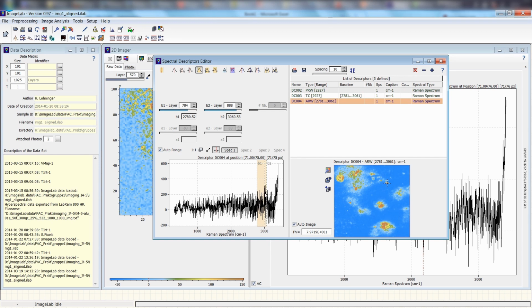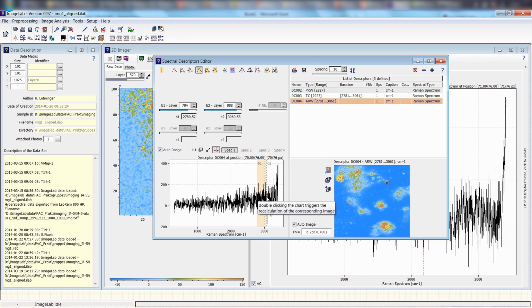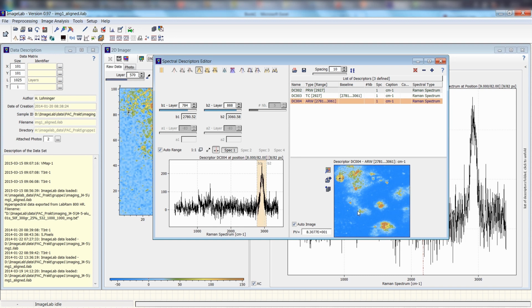And as you see here in this particular tiny spot, you get here noisy data, but the average of these noisy data points is around 100, and of course this creates a spot, because only those parts which are zeroing out will create zero levels. And of course this spot is clearly visible, and now the idea is, if we can introduce chemical knowledge, then it could get much better.